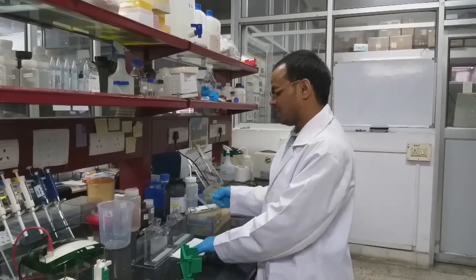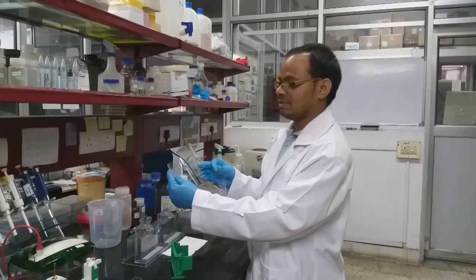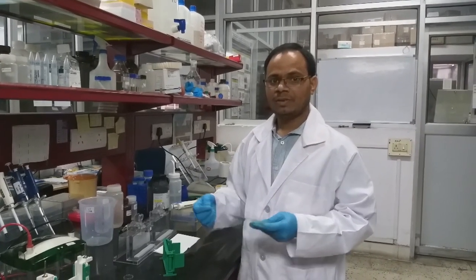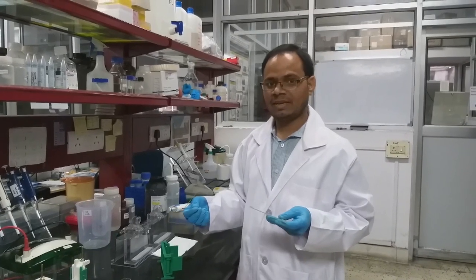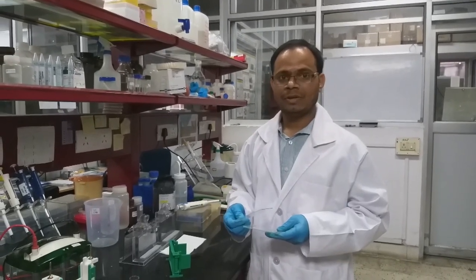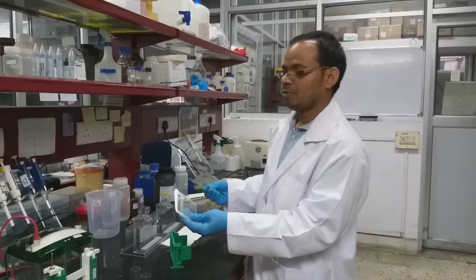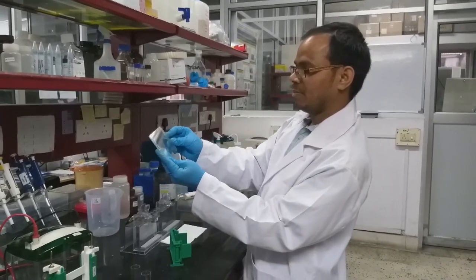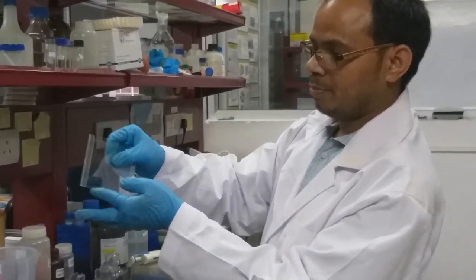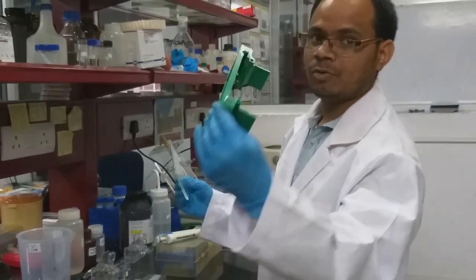So these are the glass plates. This is a very thin one. This is the main glass plate, a 1.5 mm glass plate. It is available in 1 mm glass plates also. If your loading volume is small, like 20 or 30 microliters, then a 1 mm gel is good enough. But if you have larger volumes like 70 microliters, you can use 1.5 mm. You have to arrange the short plate on this plate, and the bottoms should be equal. Then we have to put it in this tray.